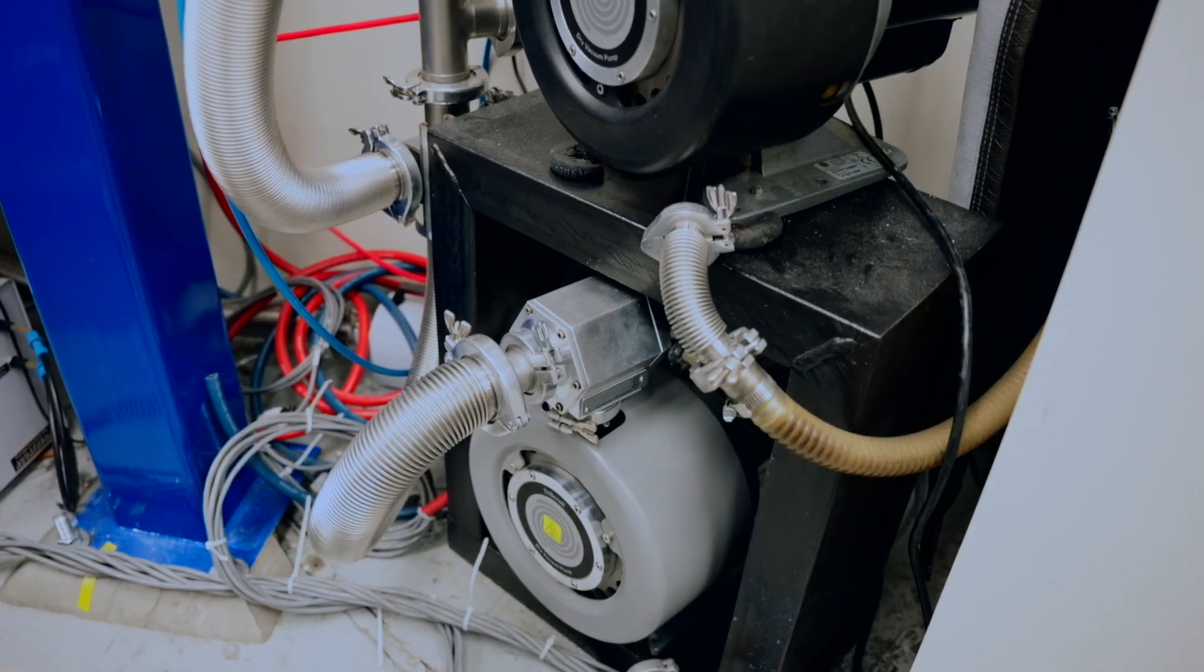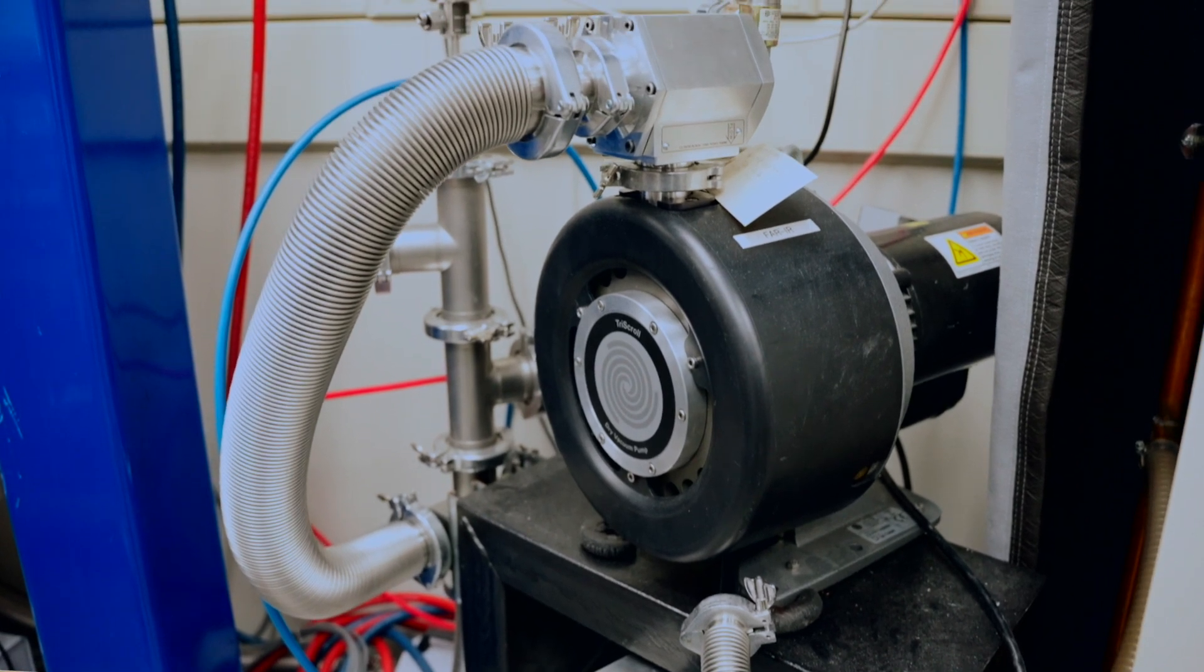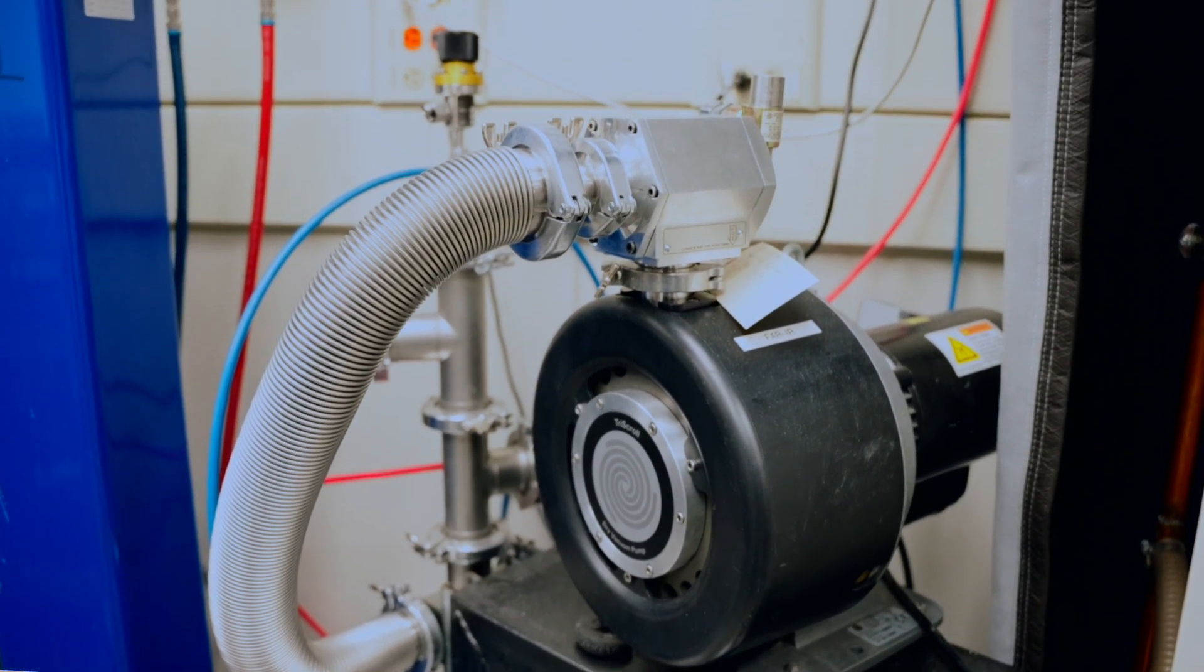With the synchrotron, because it is such a small source, we can get all of that light through even a small aperture. We can have our super high resolution and we can get good throughput and really good signal to noise.